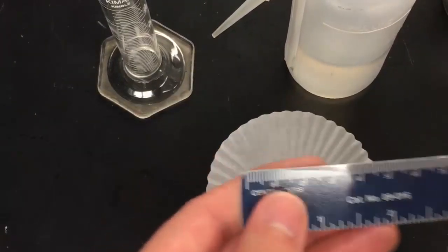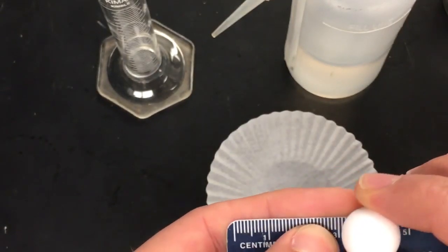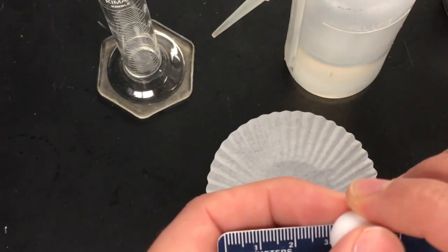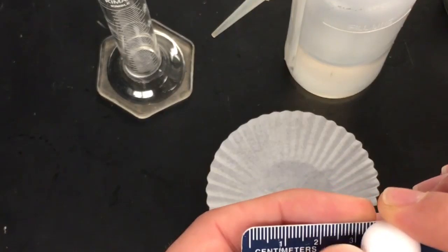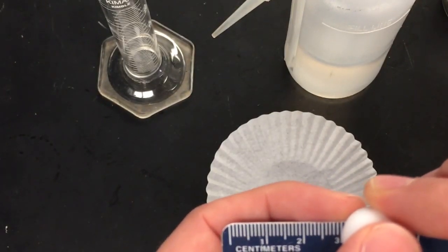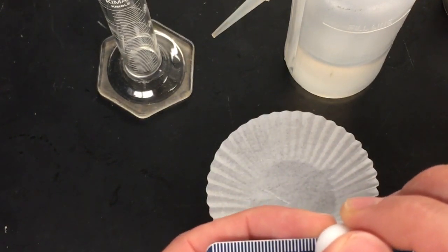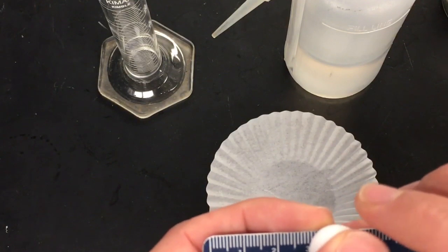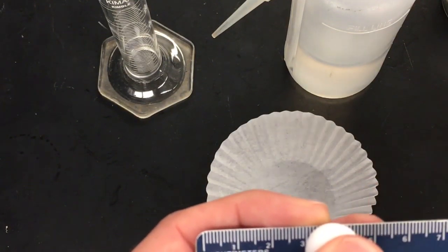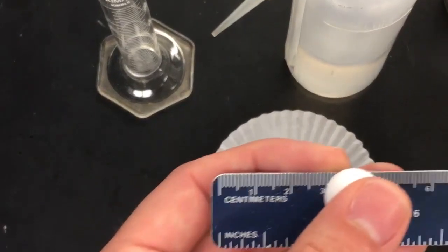I try to just see at what unit it eclipses. So I could say 3 centimeters is my new 0, right? So 4 would be 1, it's arbitrary however you do it. So I would try to line it up to where, with my line of sight, I'm right on that leading edge for the line of 3. And then it's really hard to do this looking into the phone.